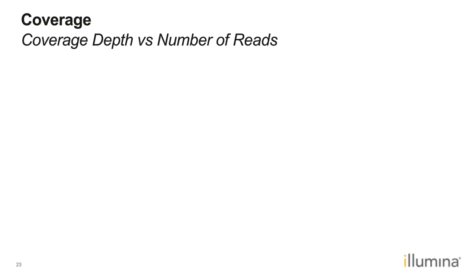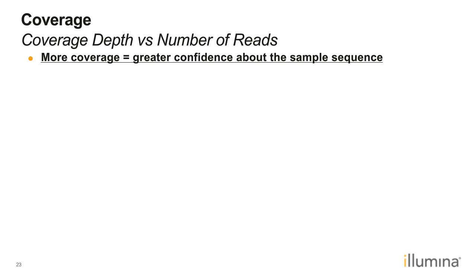And one question that we get a lot is about coverage. What coverage depth do I need for my RNA-seq analysis? We know that more coverage will give us greater confidence about the sample sequence. So let's say that the sequence in the gray bar is our reference sequence, and our blue transcripts are going to be our reads that we get from our sequencing experiment.